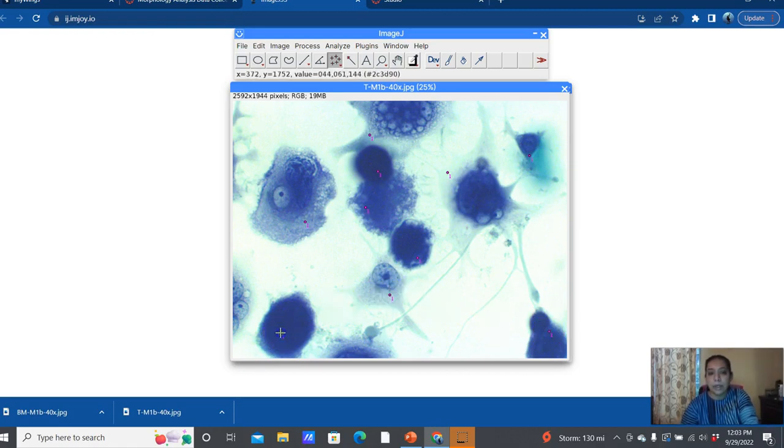You want to make sure that it is a cell that's pretty much present in its entirety if you're going to be measuring it, especially. This field had very few cells, obviously, so I still used this one, but normally we would not be using those. And then if you put one where there shouldn't be one, you can always move it or delete it.